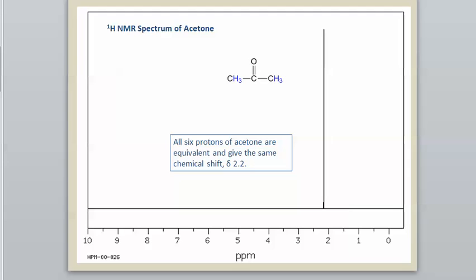But for the time being, these examples show you both the structure as well as the spectrum that goes along with it. Anyway, we'll start with a simple spectrum, and this is as simple as it gets. A single peak here with a chemical shift, as it says, of around 2.2. Now, if all I had to go on was just the graph, I couldn't automatically tell you what molecule this corresponds to. So I would need some other clues. But I could tell you that no matter how many hydrogens that molecule has, they are all equivalent to each other. And as it says here, this corresponds to acetone or propanone.